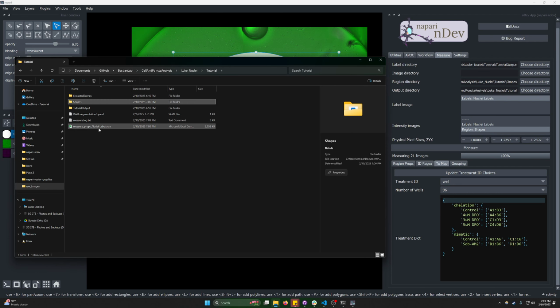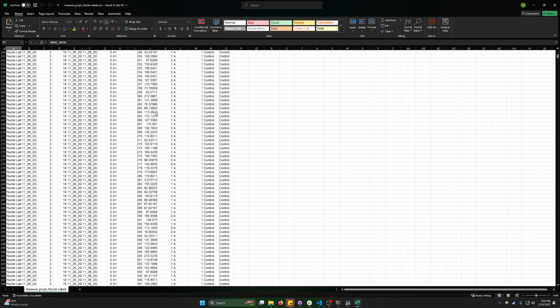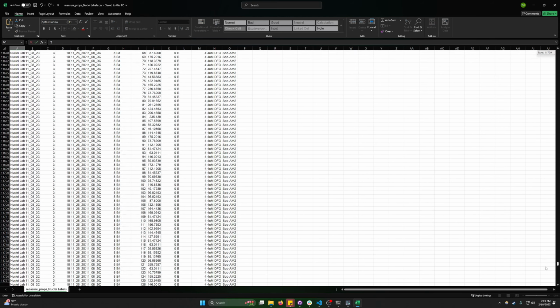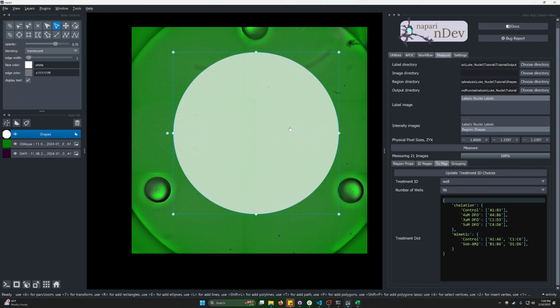We come in here, and now we have this large-ish file. Wow! Which has 1 row for every single label, and you can see they're slowly changing as we scroll through. And this ultimately has 12,000 rows. Not very useful. So we're going to come back here.